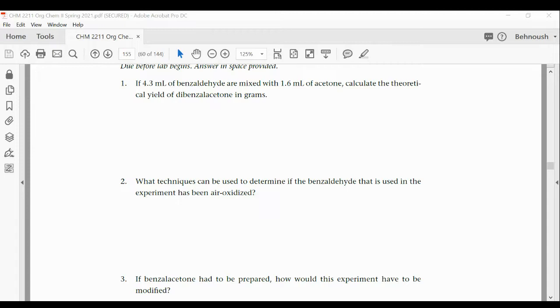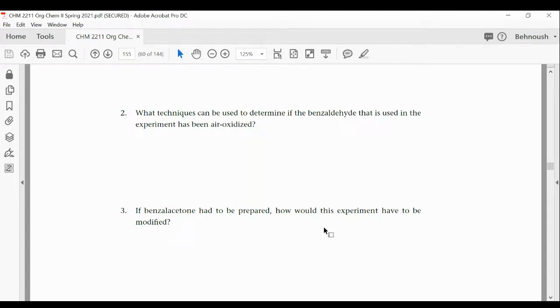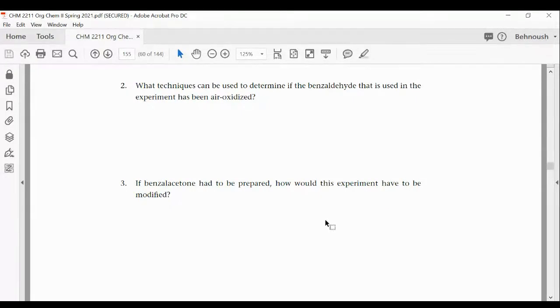So we have 3 different methods. If you explain one of them clearly, you get credit for this question, but I want to make sure that you know all the different techniques, and each one of them would be a correct answer. So you can use either IR, pH, or sodium bicarbonate.